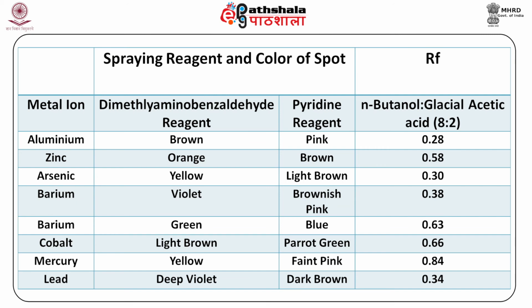N-butanol to glacial acetic acid in the ratio of 8:2, after spraying the TLC plate with dimethylaminobenzaldehyde reagent and pyridine reagent.